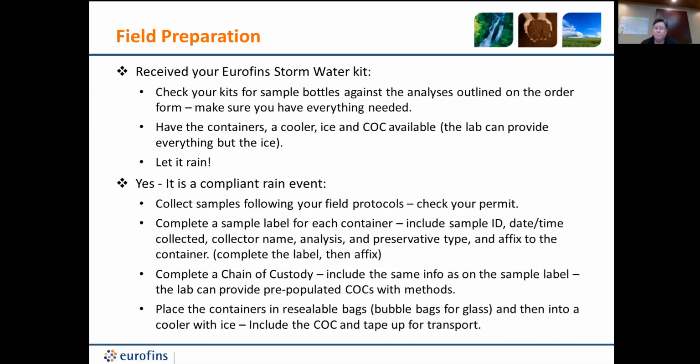Yes. Secondly, there is another follow-up question. What is the shelf life of a kit? When should we replace it? So most kits, there's 2 thoughts. If you have what we call unpreserved containers, it's just a poly bottle or a glass container that has no preservatives in it, no hydrochloric acid, no sulfuric acid, no sodium hydroxide, anything.